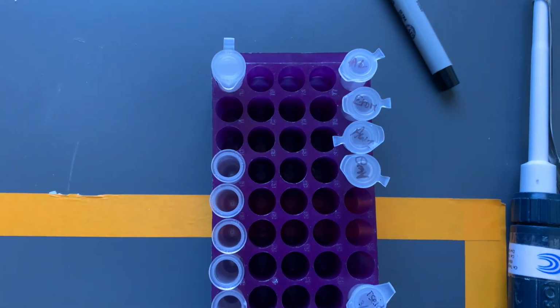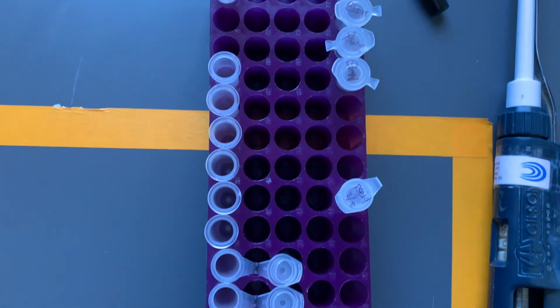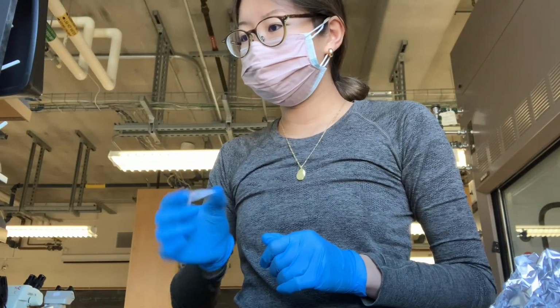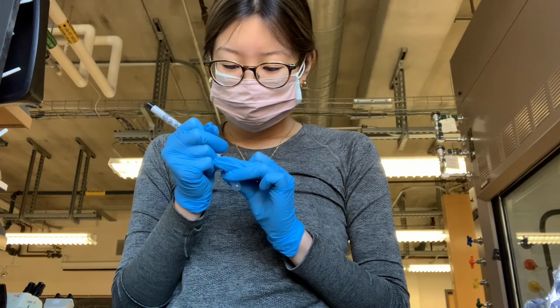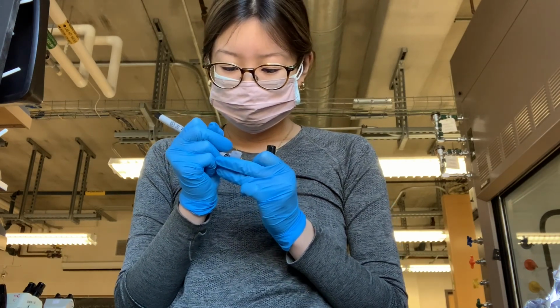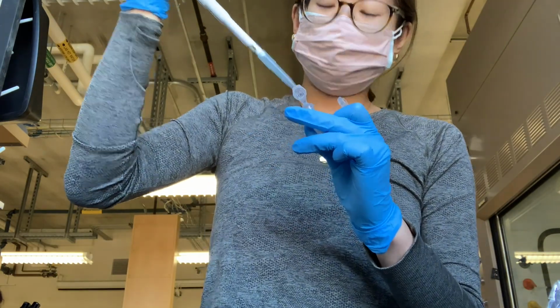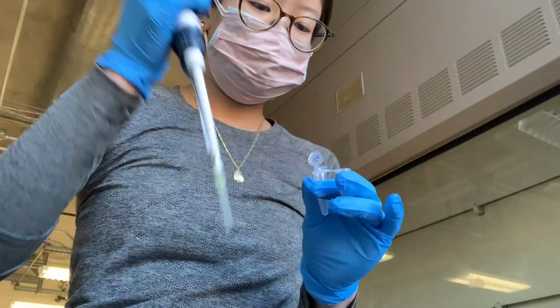To review, I'll be using AL buffer, ethanol, AW1, and AW2 buffers to extract the DNA. Now that my sample has been isolated from the filter and put in a new tube, I'll add the AL buffer and ethanol, making sure I mix thoroughly. After vortexing, I'll be adding AW1 buffer, centrifuging, and adding AW2 and centrifuging again. Once I've added 2 rounds of nuclease-free water to elute the DNA from the spin column, I'll be done, and I put the sample at the instructor's bench to be frozen until the next lab period.